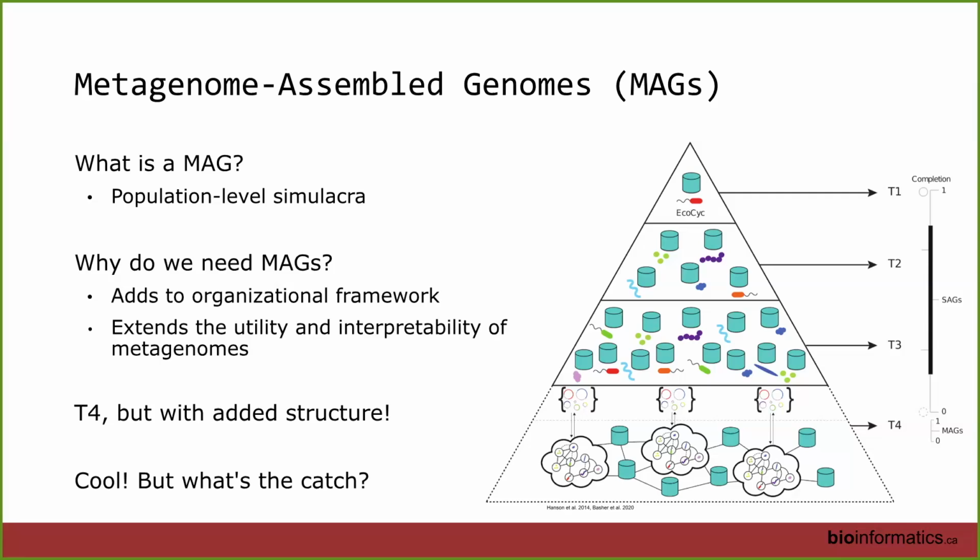So it's a really nice organizational framework if we're interested in breaking the community into components and starting to get a feel for what populations may be responsible for different types of metabolism, whether contributing to the same metabolism or collecting the outputs of one metabolism to do another metabolism. This happens a lot in the anaerobic environments that I work in. So the denitrification pathway that goes from nitrate all the way down to dinitrogen gas is separated into different parts that different organisms do at different points in time as well as in space. So that's a really neat thing to be able to do.